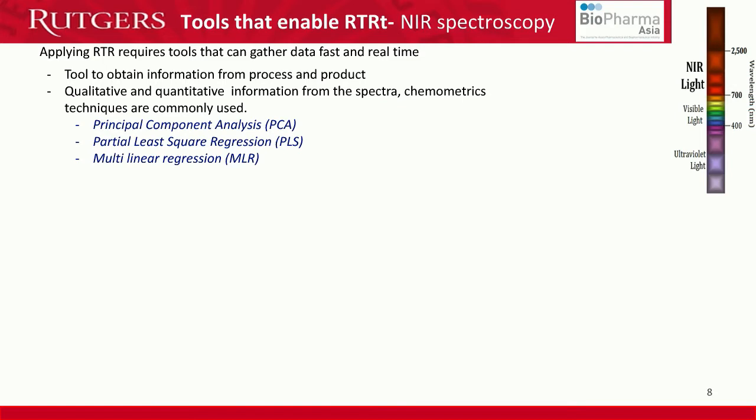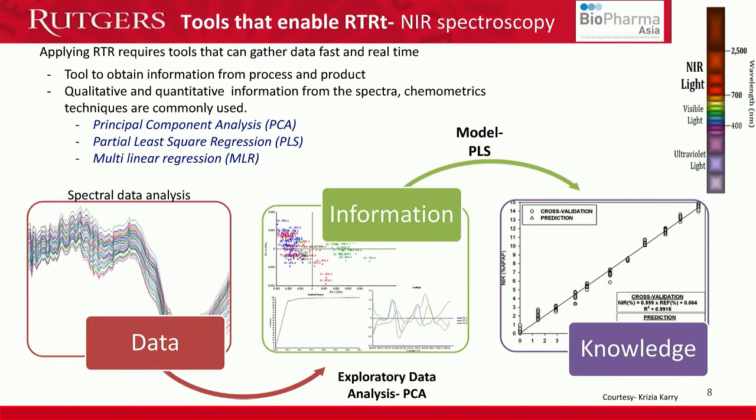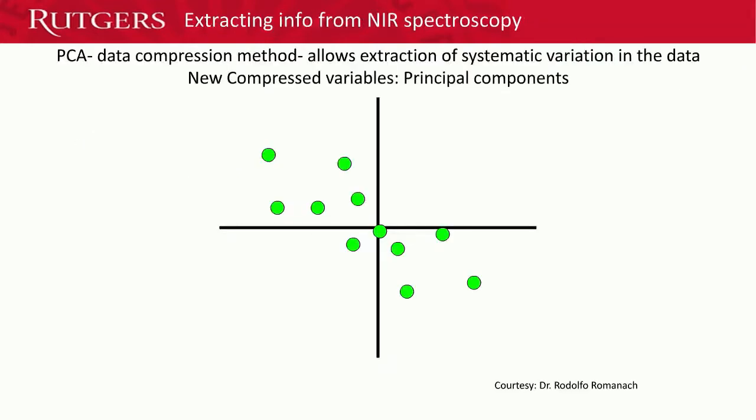And you need to extract information from the NIR spectral data. And you can do that with the help of different algorithms that are mentioned here. You can use principal component analysis, you can use partial least squares or different regression methodology. So if you extract information using principal component analysis, for example, you can use it to relate to your responses using any kind of regression methodology. So in the figure that you see at the end on the slide, we have spectral data on the left. This is the data that you are going to get from your NIR spectrometer. This data is multivariate, and that's when, to extract just the main information from this, you can use algorithms like the PCA. And I'm going to talk about that on the next slide.